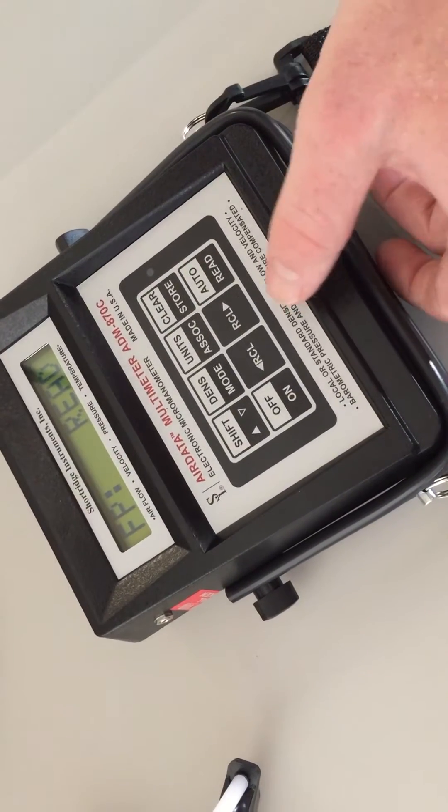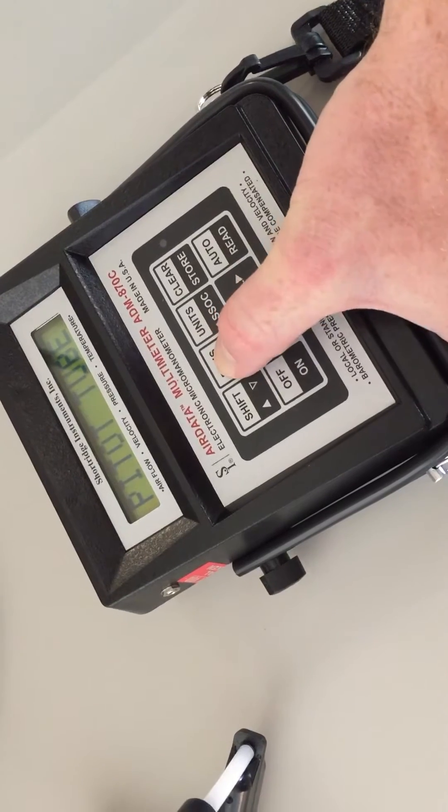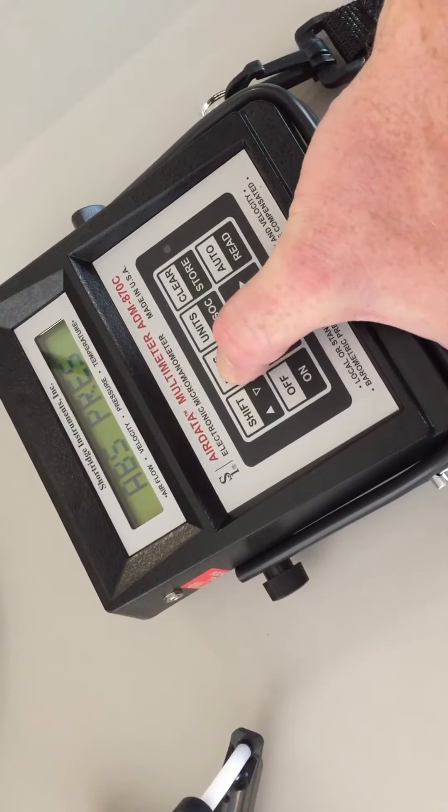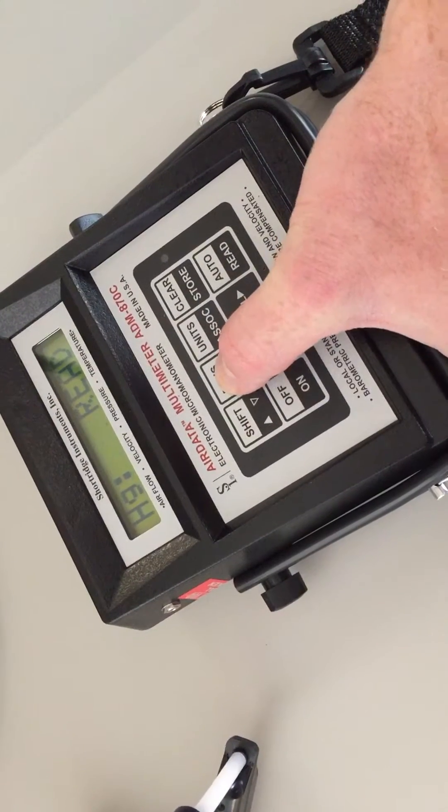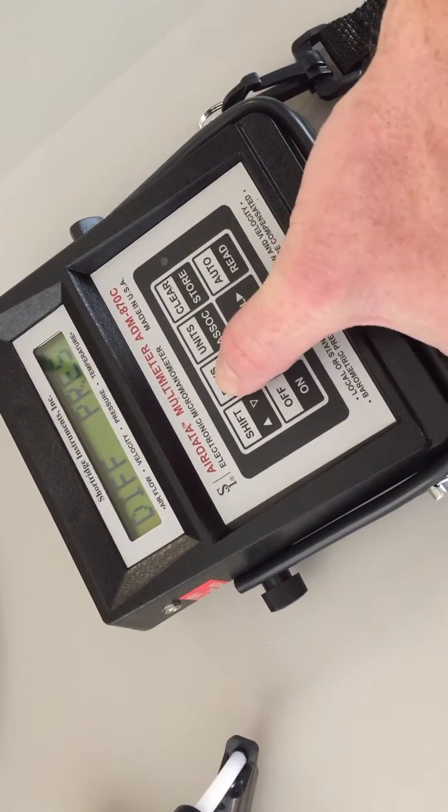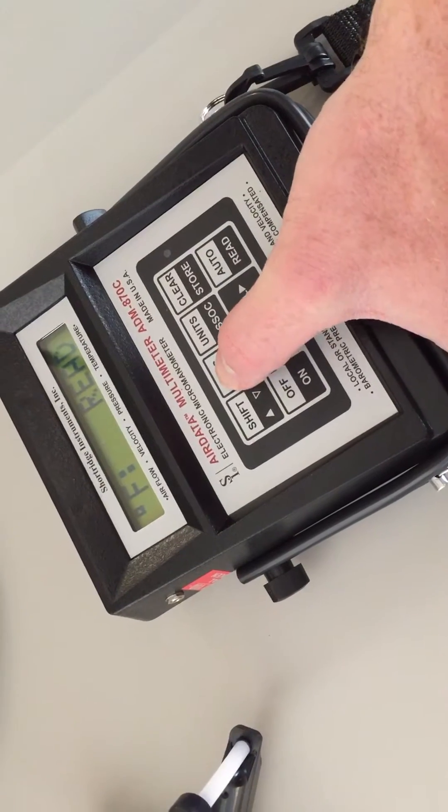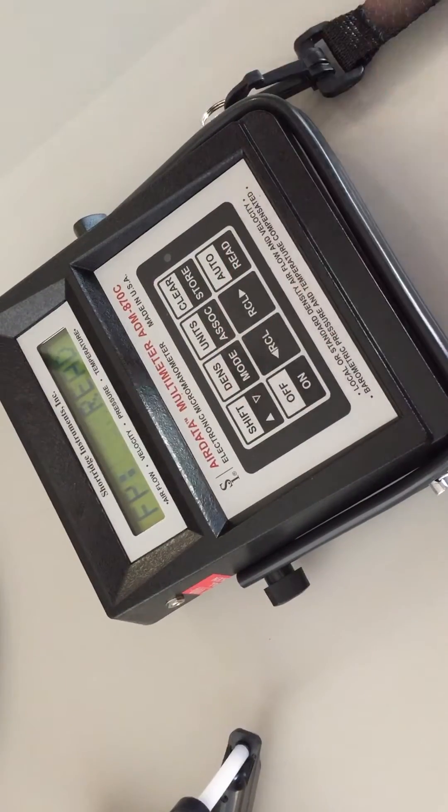To select the mode that you'll be measuring in, hit the mode button to scroll through the different options. Today we'll be using the Bell Grid measurement device.